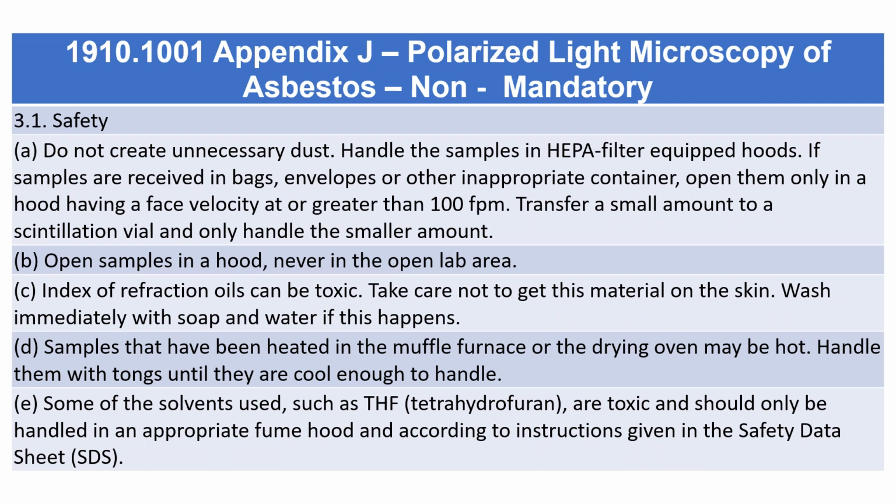3.1. Safety. A. Do not create unnecessary dust. Handle the samples in HEPA filter-equipped hoods.